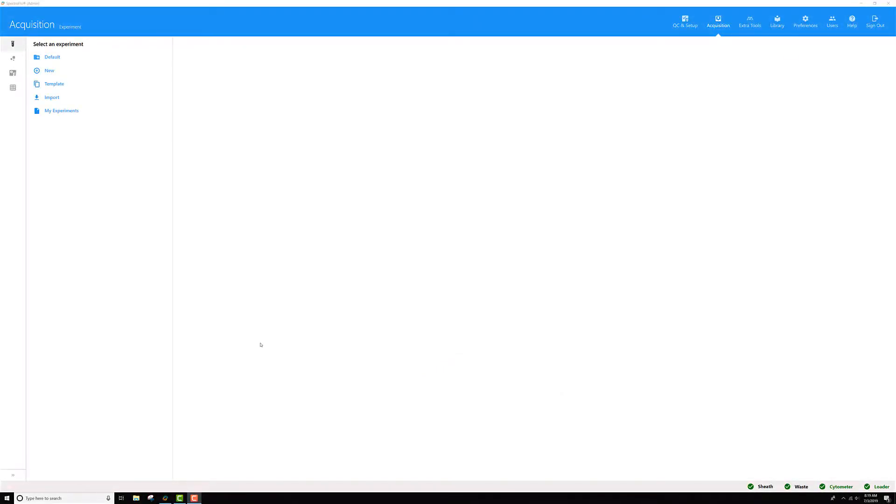If you want to run a plate on our loader that has a slightly different well-to-well geometry than the plates that Scitec has tested and recommended to use, you can adjust the calibration using the admin user account.